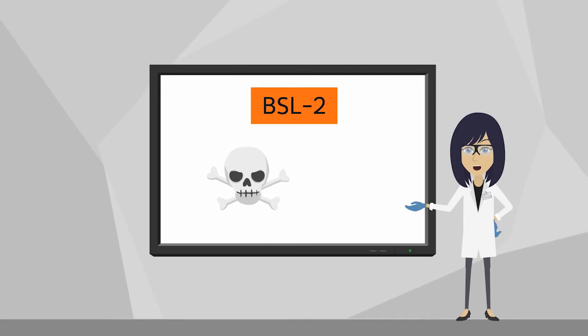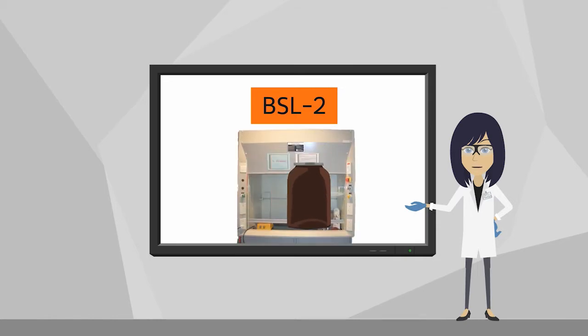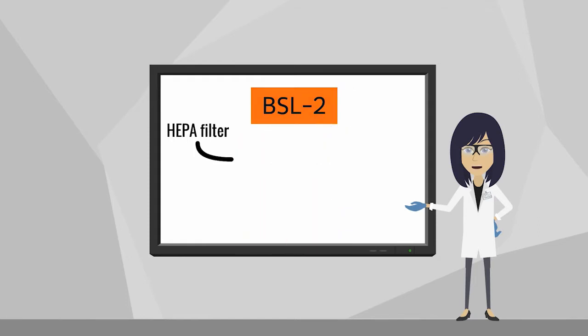Biosafety Level 2 poses a higher risk than Level 1, and may be pathogenic. For large volume handling, these must be under a biosafety hood, which is used as a containment for infectious agents. The BSC has a HEPA filter in the exhaust system to protect the environment and yourself. This type of filter is a high-efficiency particulate air filter. It is able to remove particles at a size of 0.3 micrometer with an efficiency of 99.97%. It is also able to remove both smaller and larger particles.